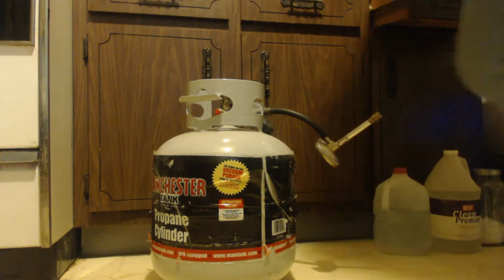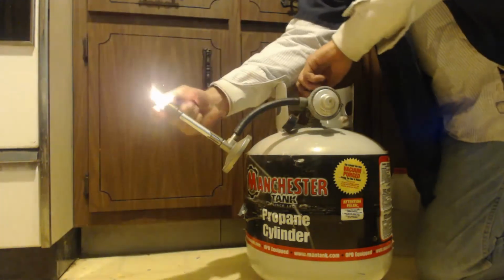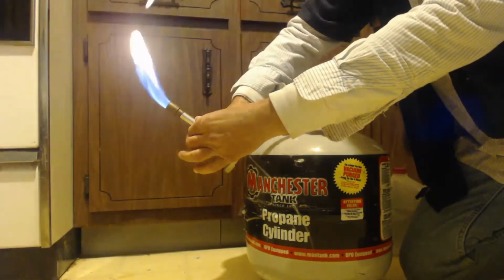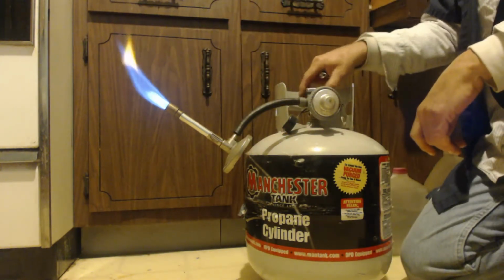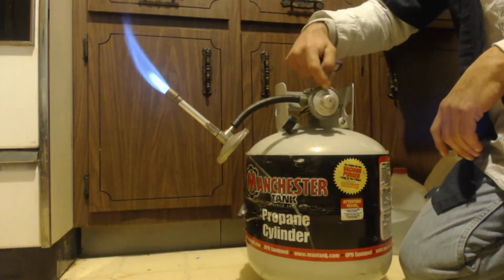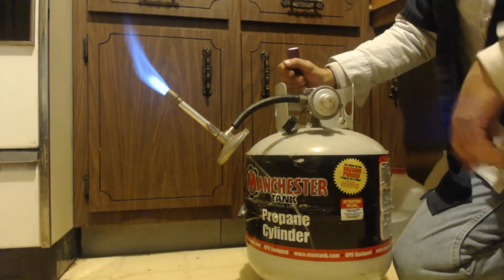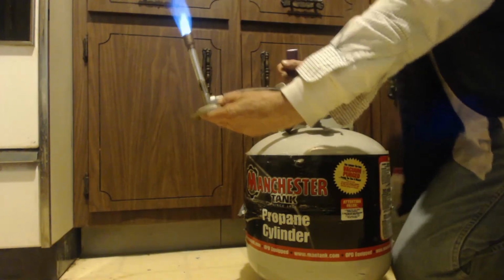I just wanted to show my Bunsen burner again here. Check this out. Blue flame. See that? And this here is just from a pancake regulator and a hose from a gas grill. I just cut it off and put it on there. I need a longer hose, obviously. But see there? Pretty nice.